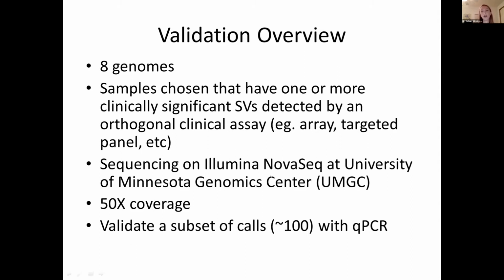We are sequencing on the NovaSeq at the UMGC. We're using 50x coverage, and we then are taking our call set and validating a subset of the calls, about 100 of them, with qPCR, which is a clinically validated test in our lab.